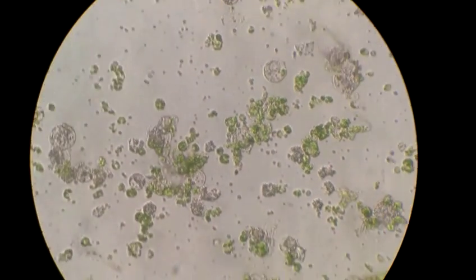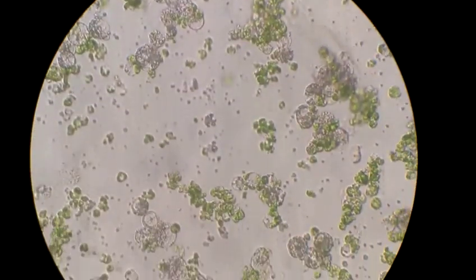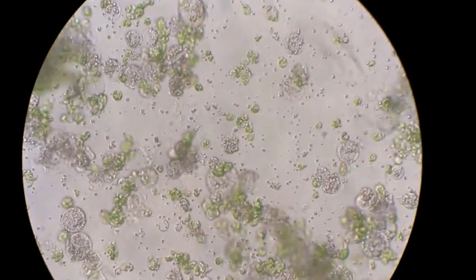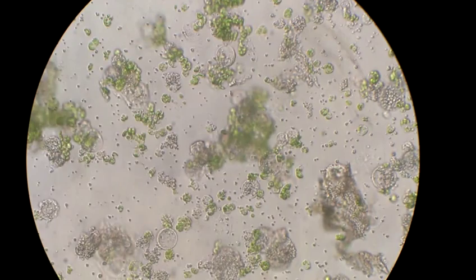Anyway, so this is what I do — a little insight into the miniature world of protoplasts.